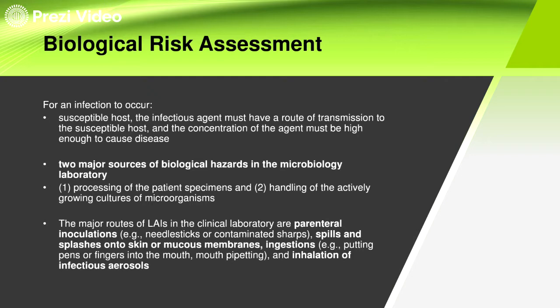So, example of that is putting pens or fingers in the mouths and also mouth pipetting. And then last is the inhalation of infectious aerosols. So, if you are working in the lab and you don't have a mask, definitely you're going to inhale whatever infectious particles are in the specimen. That is what you call the infectious aerosols.